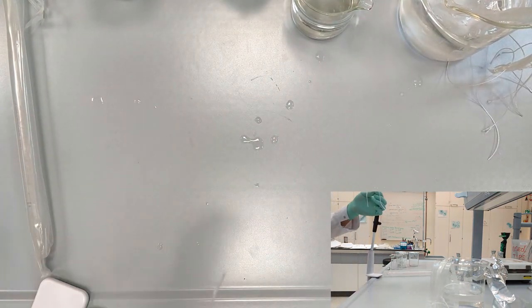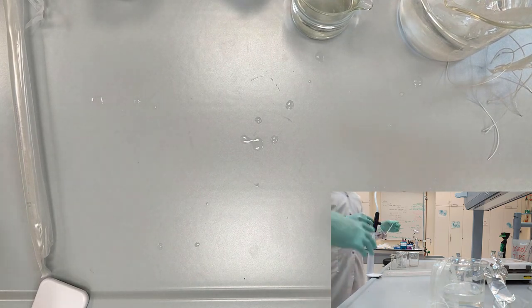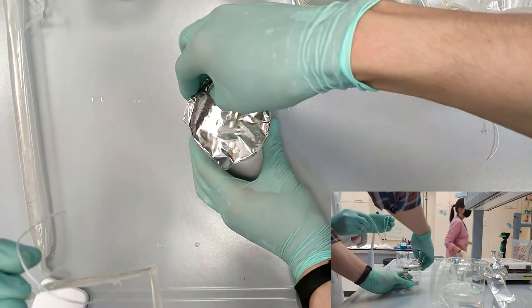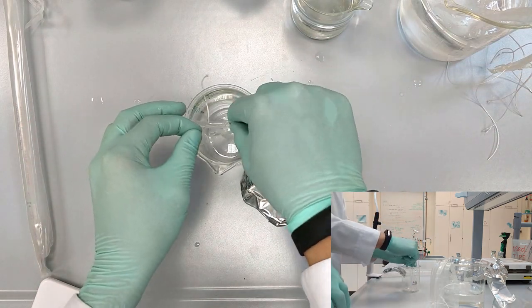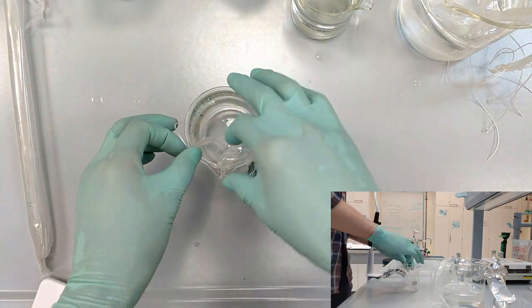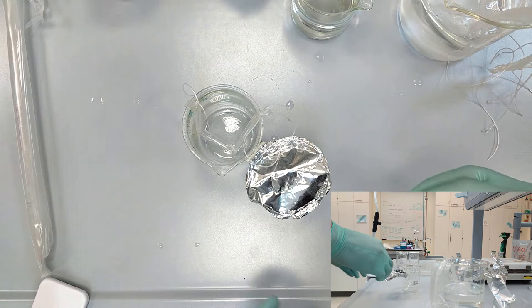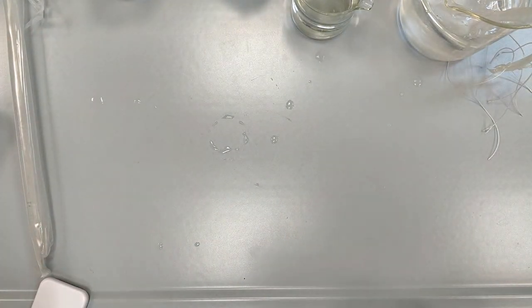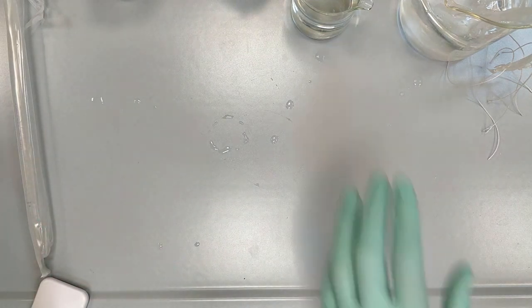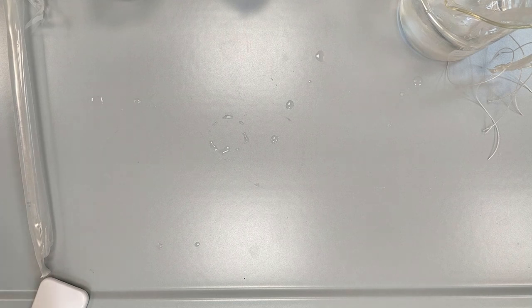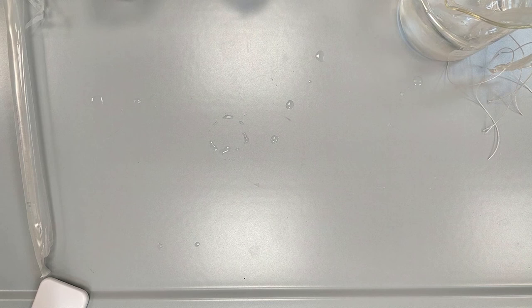After clipping this side, we are going to weigh this dialysis tube and write down the mass for further calculations. So put it inside the beaker for now, bring the scales, dry the dialysis tube before that and determine the mass.